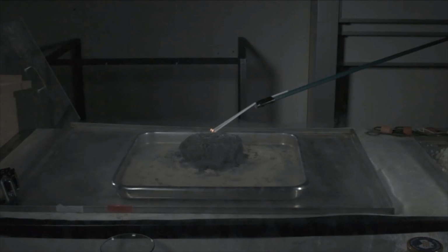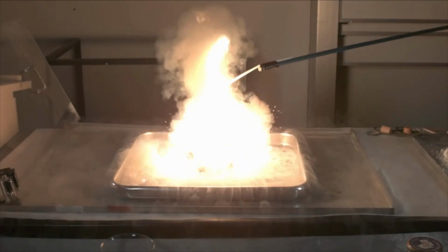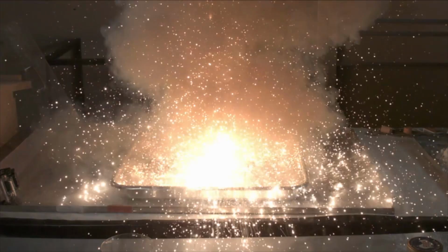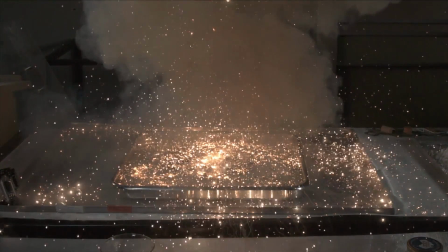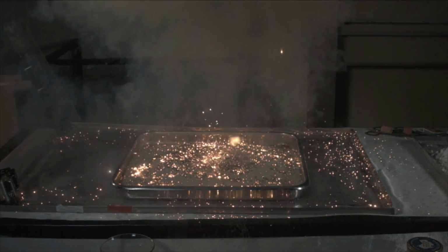Wow, so you can certainly see that a lot of energy has been given out there. In fact, I can warm my hands here quite nicely. It's very, very warm now. But this shows that energy has been released as the iron combines with the oxygen. And this is a very, very important point in chemistry, that energy is given out as we make chemical bonds.